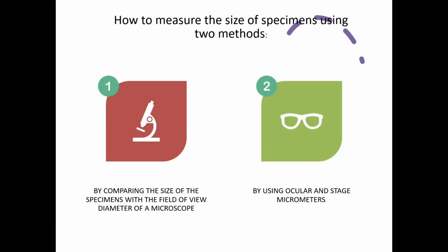In this lab, you will learn how to measure the size of specimens using two methods: by comparing the size of the specimens with the field of view diameter of the microscope, and by using ocular and stage micrometers.